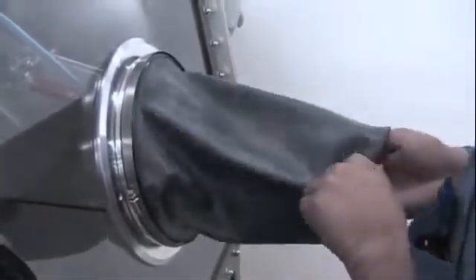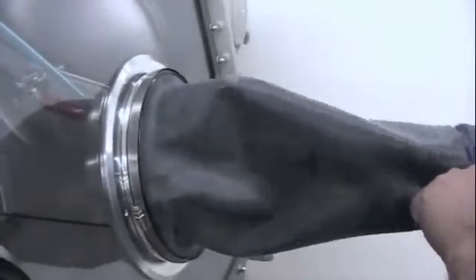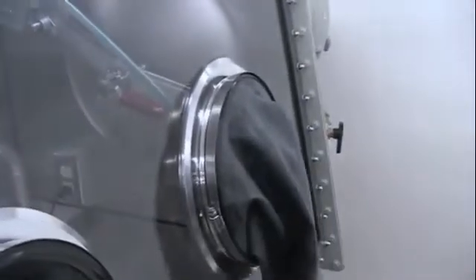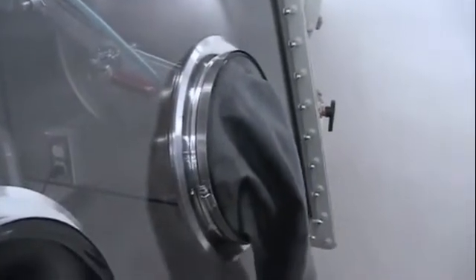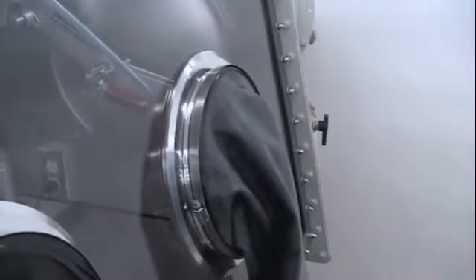Now that the glove has been installed, we have trapped a small amount of oxygen. There is a pocket of oxygen in here that we would need to displace and get rid of so that we do not dump it inside of the glove box atmosphere. So to do that, we are going to evacuate the glove.